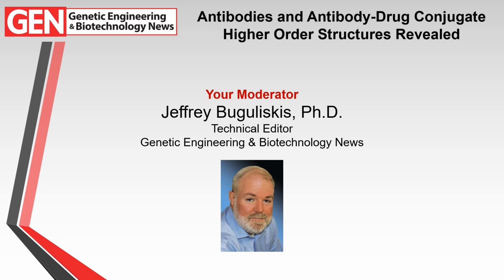The characterization of proteins has historically been a challenging discipline, as structural complexities vary greatly between individual protein molecules. As therapeutics increasingly rely on the use of protein biomolecules, structural characterization methodologies are more important than ever.